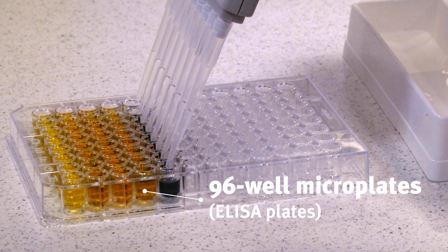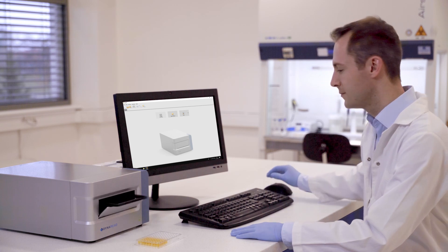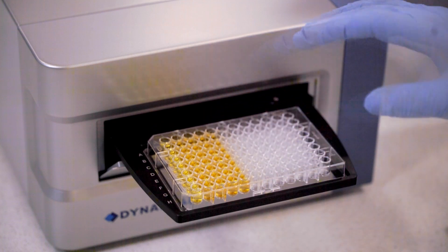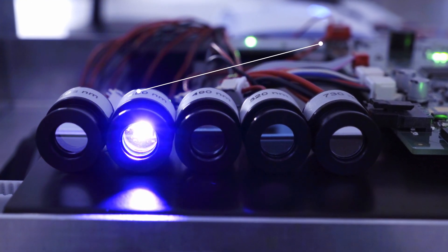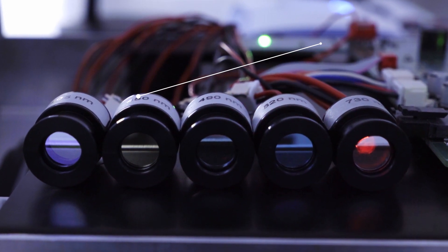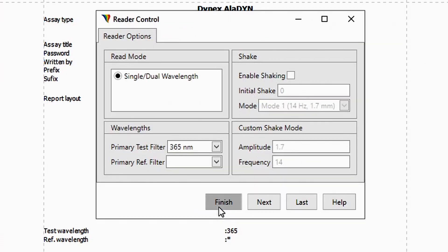As it is intended for 96-well microplates, it can be used in any endpoint protocol like ELISA, optionally also kinetic reads. The main advantage of DynaRead is an LED light source which has a long life, is reliable and stable within the whole wavelength range, so you can rely on it in terms of accuracy and lifespan and fully concentrate on your work.